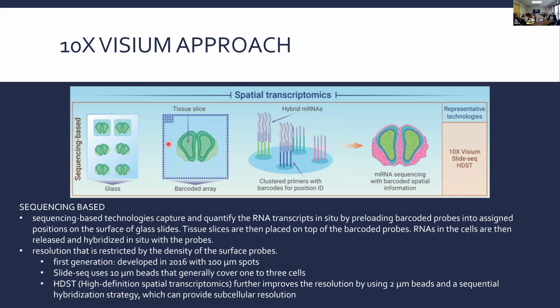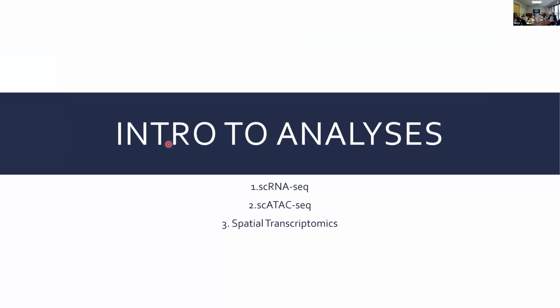In theory, if you were looking at the 2 micron level, you might even get subcellular resolution. So you might be able to say where in the cell a particular transcript is located, as opposed to just which cell has that transcript. Okay, so those are the methods.